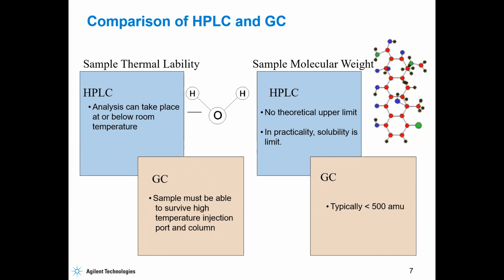It depends on the packing of your stationary phase. If the stationary phase has very tight packing, you will need high pressure. So it depends on the methodology you are doing. Some instruments are able to do just high pressure, and for some, if the pressure becomes high, back pressure will be generated and you'll not be able to have an efficient separation.